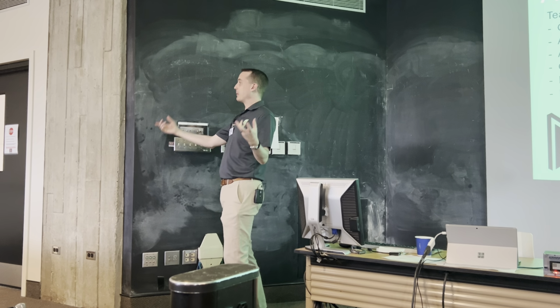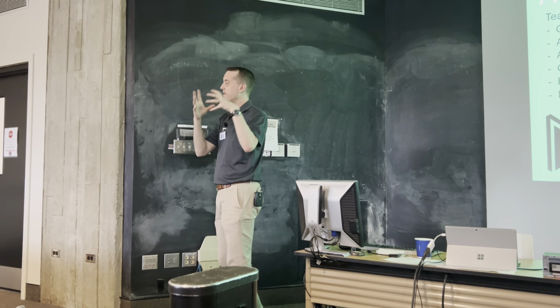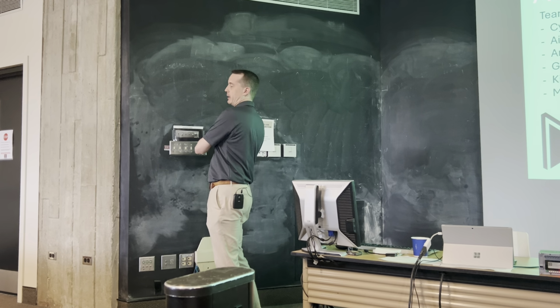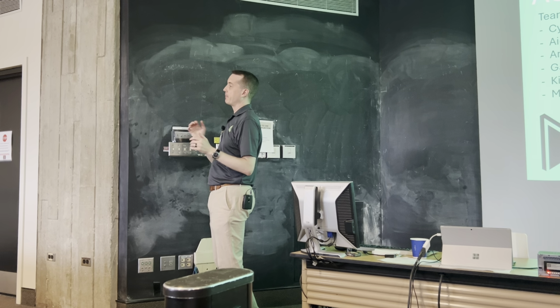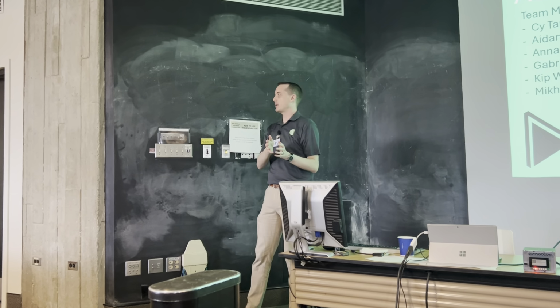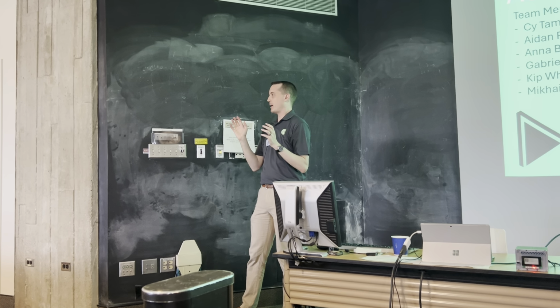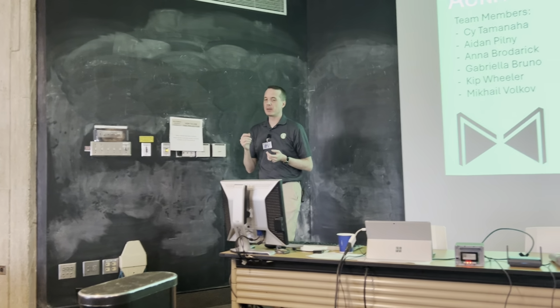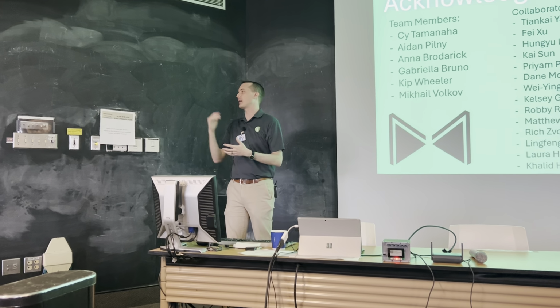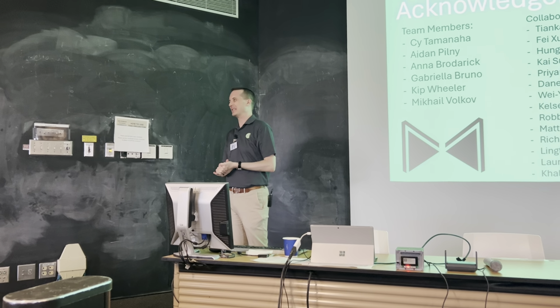That's a much broader question, and that's on the development side of that ML workflow, whereas this work at least is just focusing on the deployment, right? And deployment from the perspective of the microscopist who's like, I just don't want to have to draw boxes around black dots, right? So that's where the research is coming in, and that's where University of Michigan is doing that, and I will just have to direct you to Kevin to answer that question.